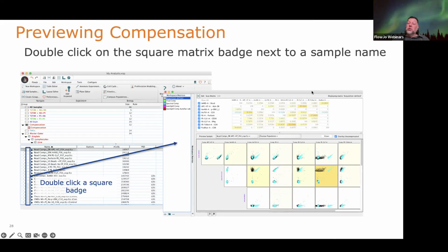I don't think many people do go that deep, right? Most of the time you're trying to look at myeloid lymphoid, you're always going to pick the populations that you want to look at most, right? I'm interested in this question about this subset.